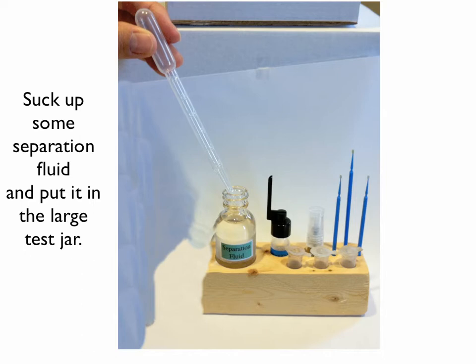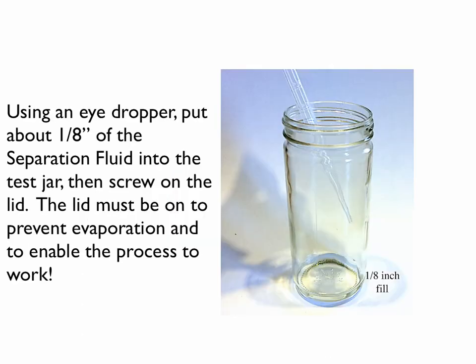Now, suck up some of the separation fluid from the bottle with the green label and squirt the liquid into the large test jar. Put about 1/8 inch of fluid into the jar and then screw on the lid. The lid has to be on to stop the fluid from evaporating and to make the whole process work.